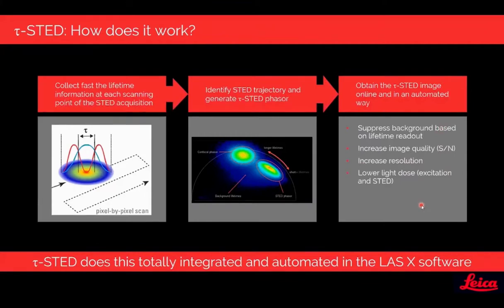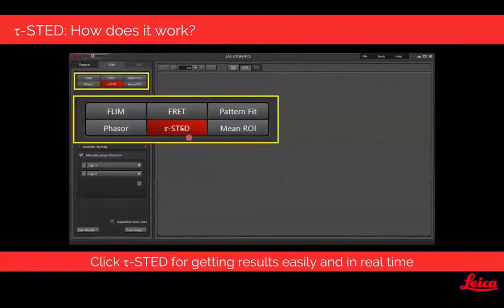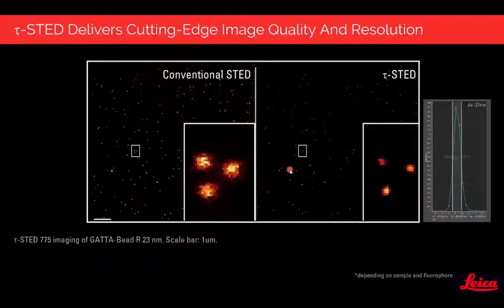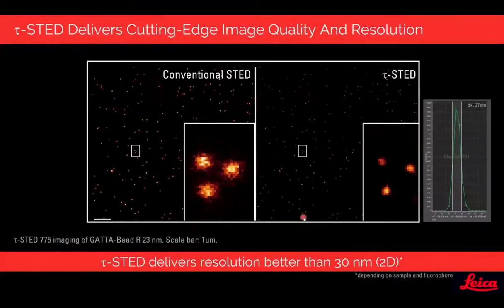How do TauSTED images look? Going back to our NPC sample, we can see the increase in resolution and signal-to-noise when we generate the TauSTED image. We can even push the resolution further — using GATTA beads containing ATTO 647N, which have a nominal size of 23 nanometers, and when we do a TauSTED experiment at 775 nm with the STED 775 line, we can get resolution better than 30 nanometers. So we can really push the resolution.